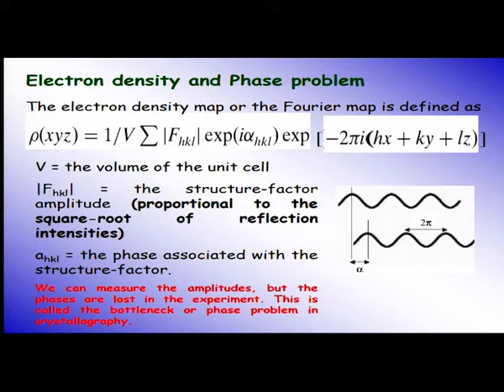The other thing is, atoms are really spherical, the electron density, because electrons are not at rest, they are moving around an atom, and roughly the center of the electron density cloud we take as the atomic site. So, being so, how can you assume a spherical atom as a point atom? These are the objections, for which both the professors gave an answer: that what they are going to propose finally is a set of coordinates for each atom, 3 coordinates, which are only approximate. Then they can go to reality by considering spherical atoms and assuming thermal vibration.